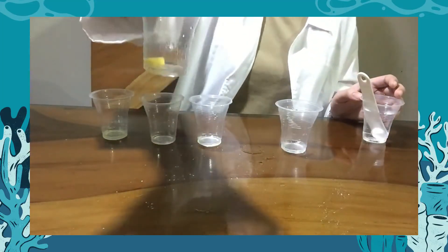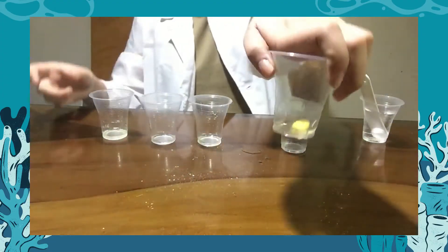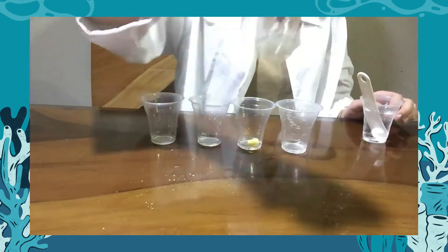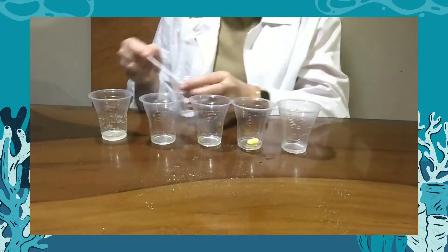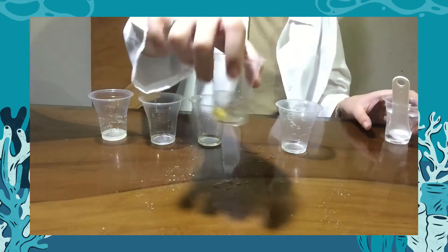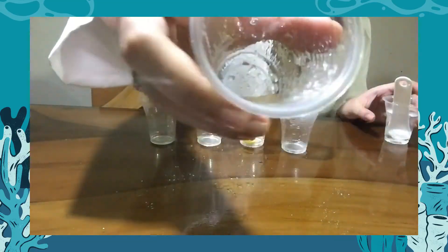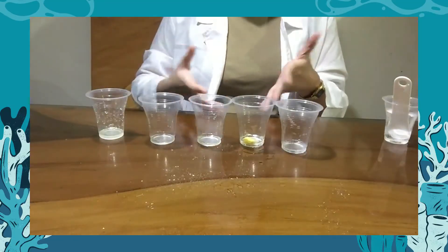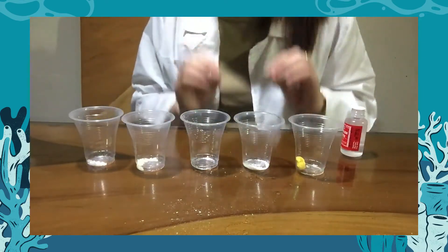Let's try harder with the margarine and water. We already added 1 ml of water, but the margarine still remained intact. For the gelatin powder, our water became cloudy and there are still some particles, so we added another 1 ml of water and shook both cups. Both the margarine with water and the gelatin powder with water still did not fully dissolve in 3 ml of water.